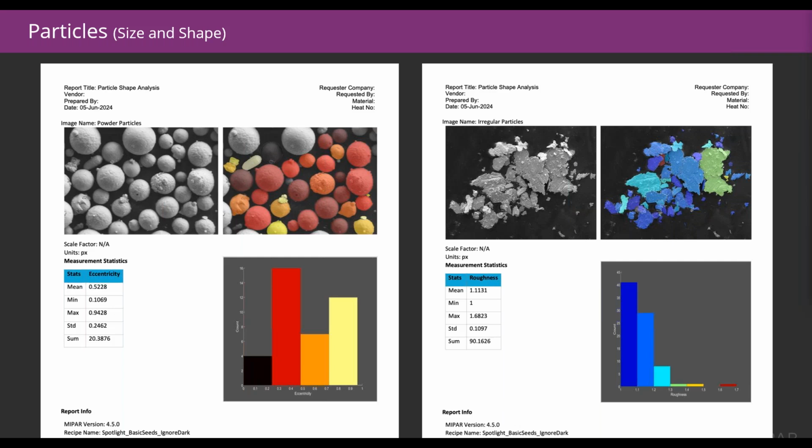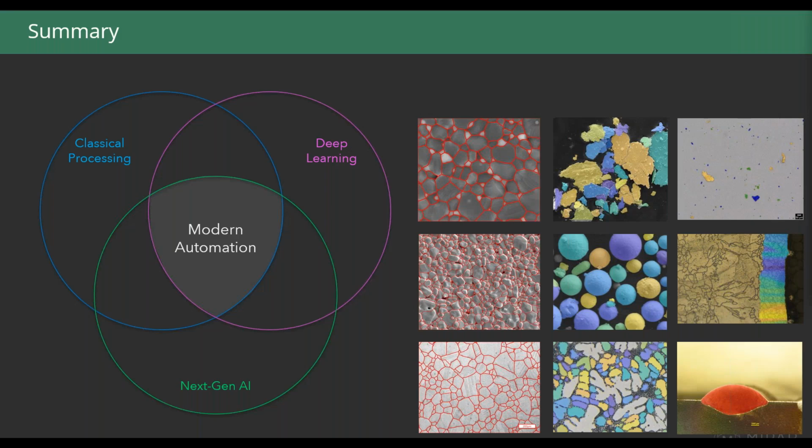Great. Thanks, John. I think we'll just leave your slides up for a while because I suspect you're going to want to refer to your slide deck again. Sure. Next question is, for the welds analysis, could you explain more regarding steps where you get very bright or dark contrast? Do you use pixel contrast, or how to characterize the edges of the weld? There's a lot here. Can you do the similar analysis on weld crack size measurements, or a different algorithm would have to be developed?